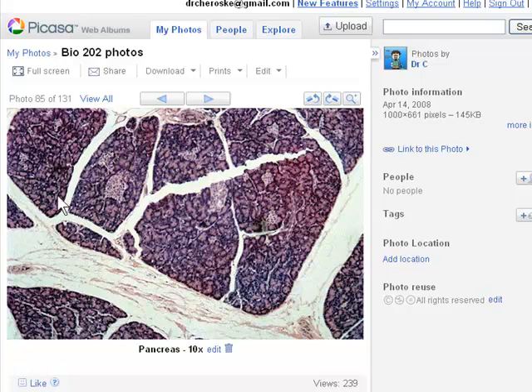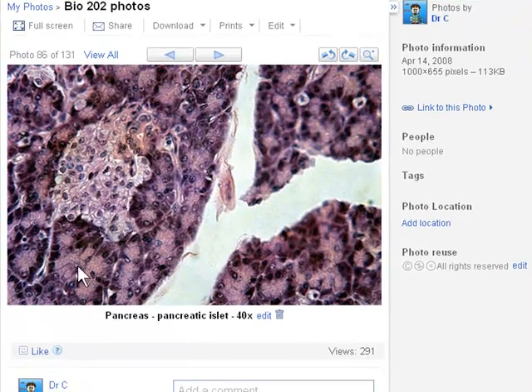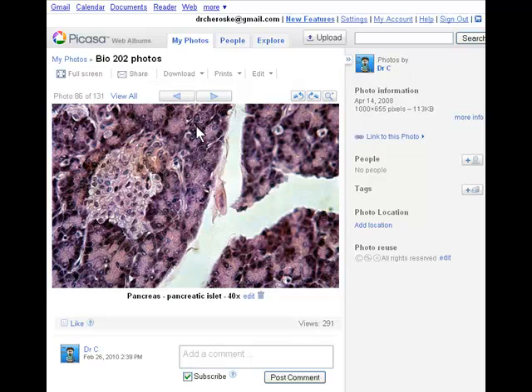What we care about right now are all the purple cells everywhere else. Those are the ones that actually have the digestive function. These are the ones that put out the sodium bicarbonate, etc., the digestive enzymes. So these are pancreatic acini, or acini, technically, which are in digestive function, as opposed to, like you see here in the bleached out area, the pancreatic islets with the endocrine function. So this is a very simple slide. All they need to know is the pancreatic acini, okay, all these dark purple cells.